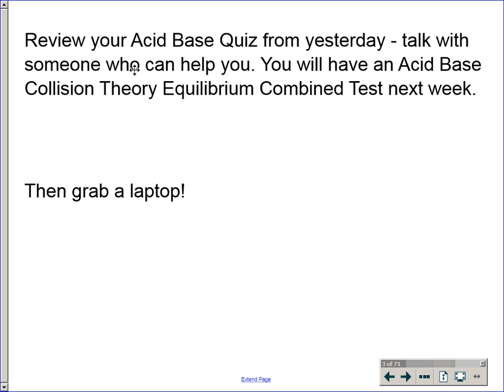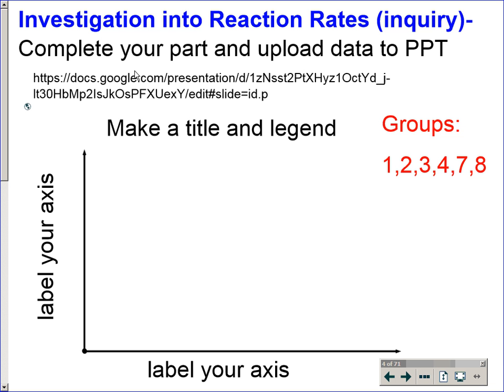We good? Okay. So, those of you who I asked to grab a laptop, go ahead and go to my website whenever you can. I just asked for a couple because we only need a couple throughout the lab. We're going to do an investigation of reaction rates. You're going to be modifying a variable, and every group will have a different variable they're modifying. Upon modifying that variable, you're going to then measure a difference in reaction rate.